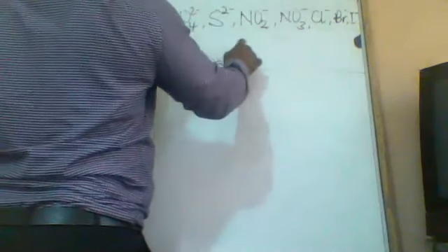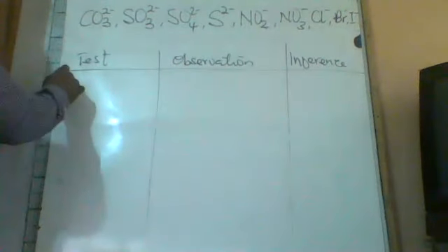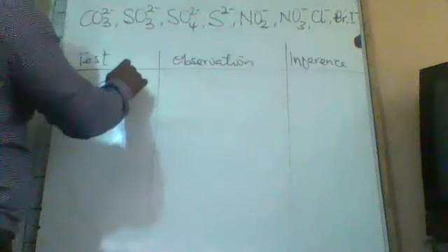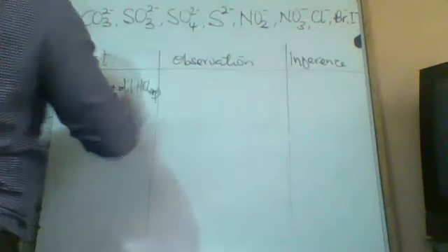So we have our test, observation, and then our inference. Let us assume that we are given solution C. Let's use solution C plus dilute HCl, aqueous.